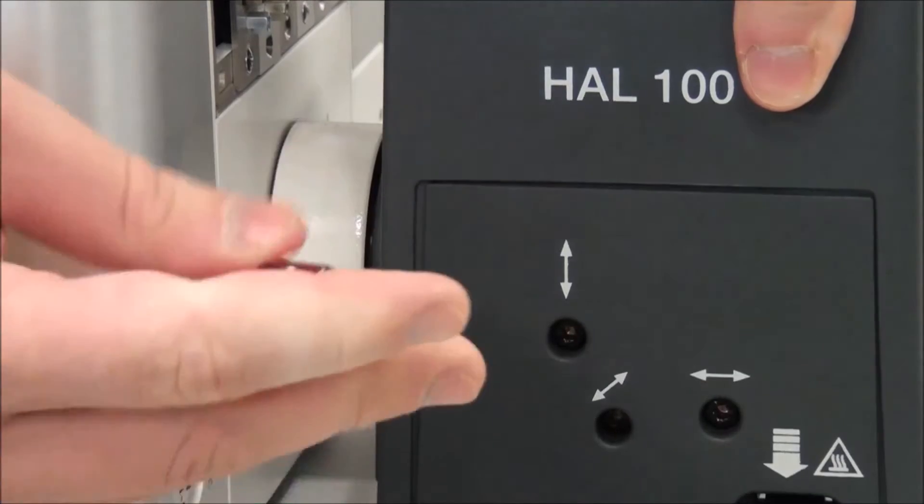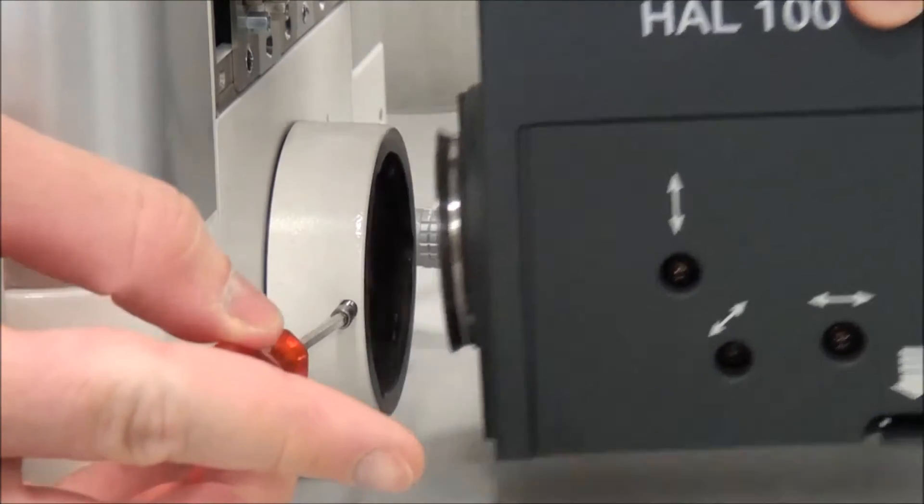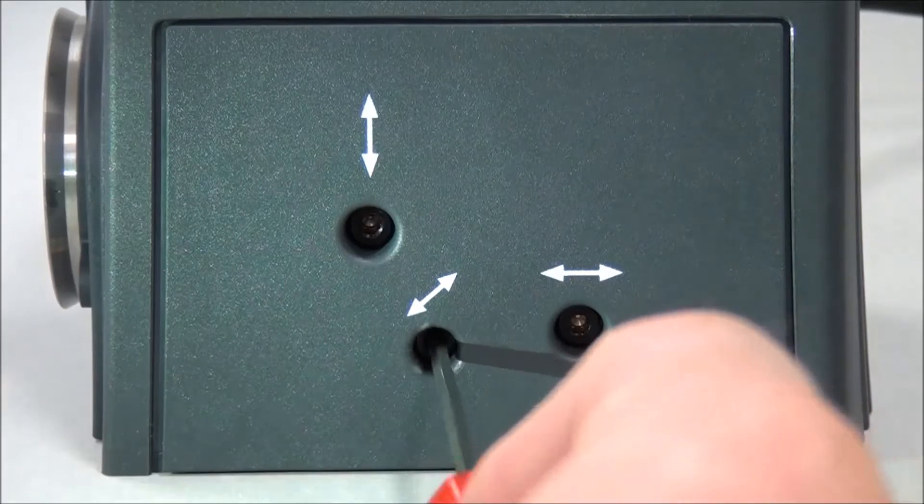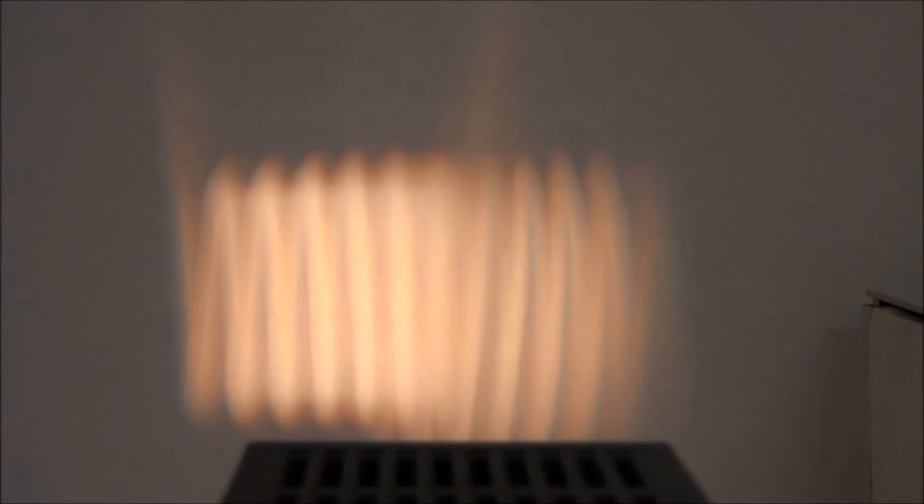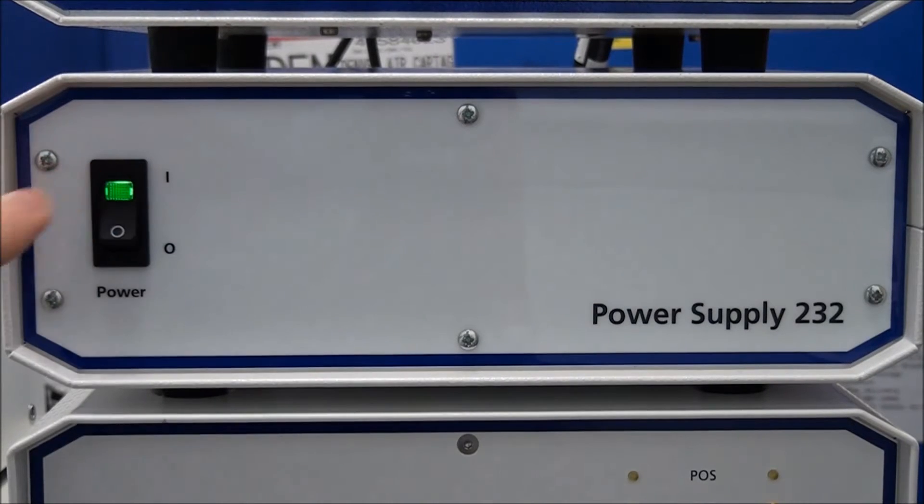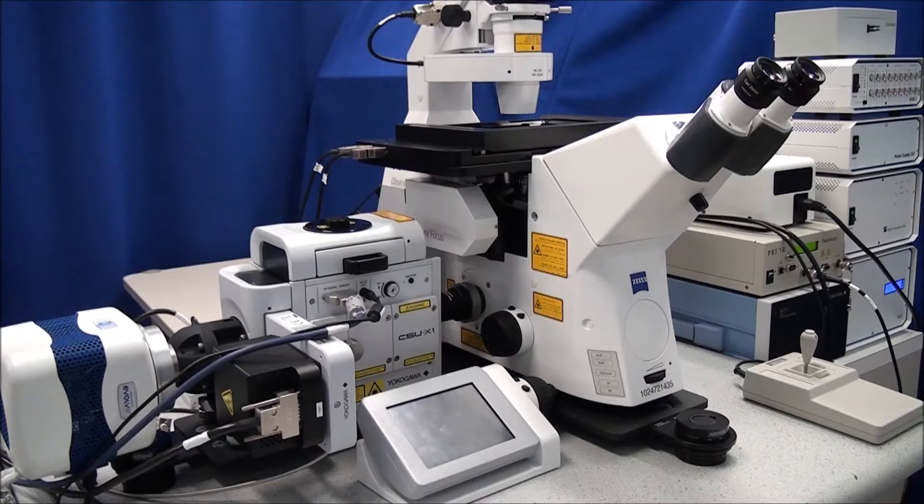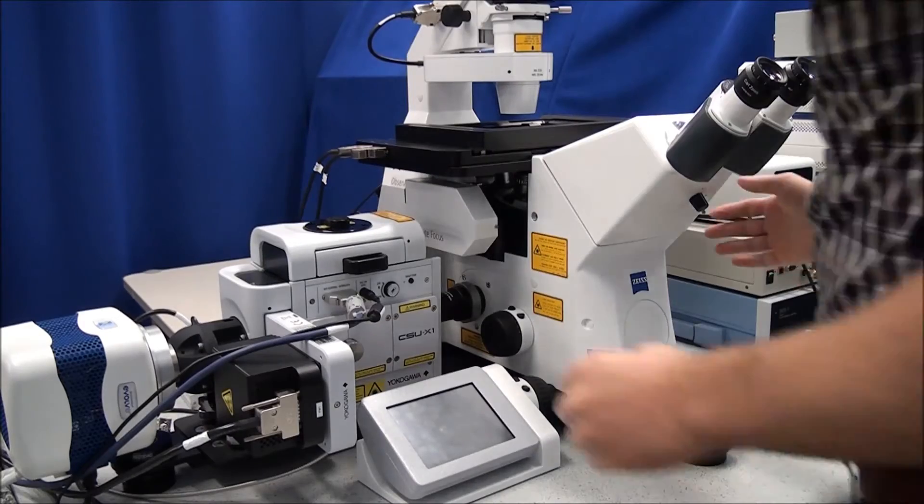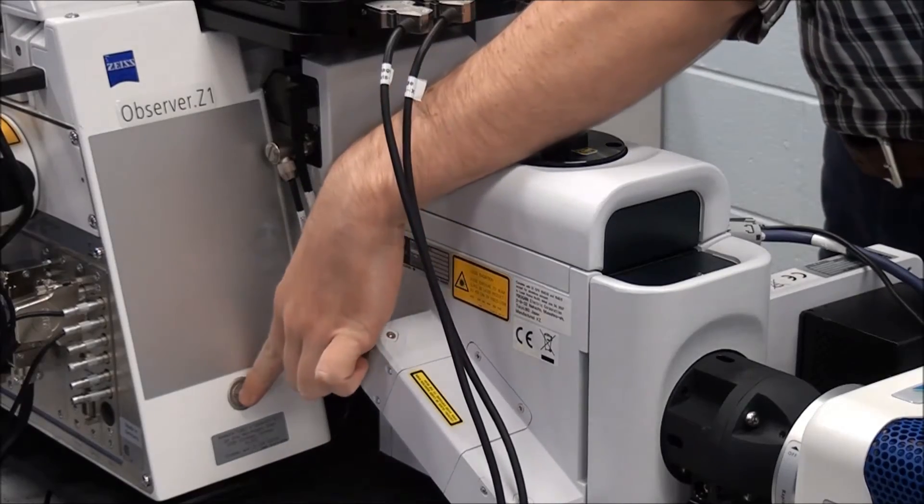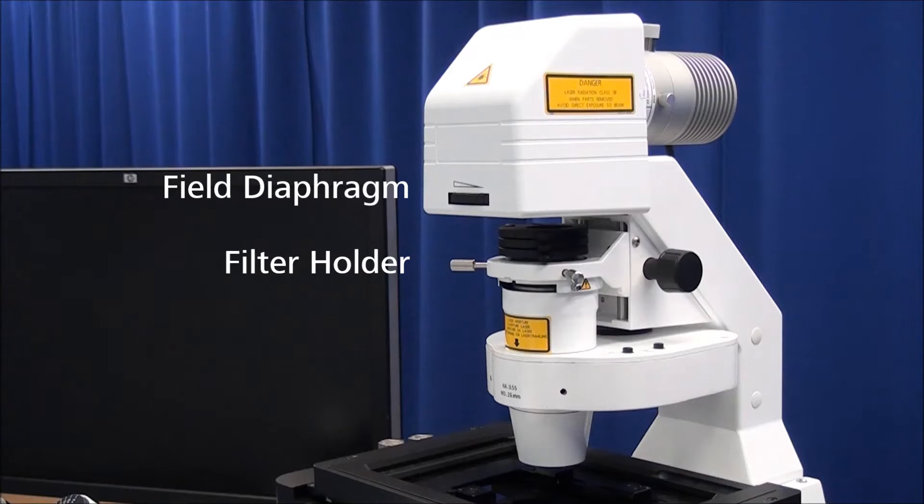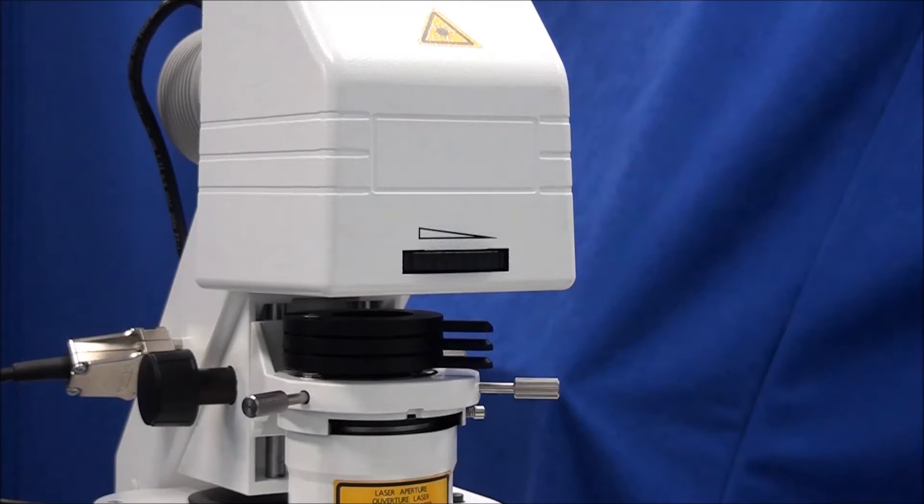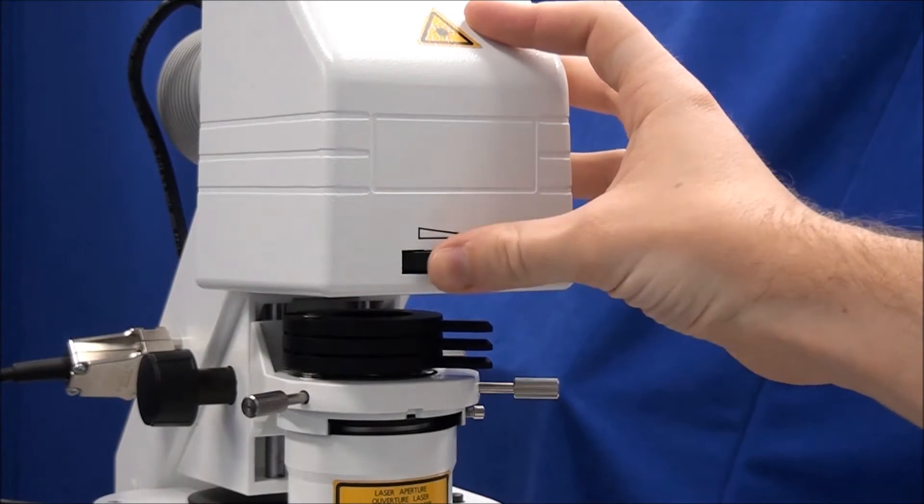If your microscope is equipped with a halogen, or HAL, lamp housing, be sure that you have aligned the HAL bulb before setting up Kohler. This process is covered in the companion video, How to Align and Focus Your HAL Lamp for Kohler Illumination. Switch on the Observer via the power supply box and the power button on the stand. Open the field diaphragm located on the transmitted light arm and swing the lollipop filter changer out of the light path.